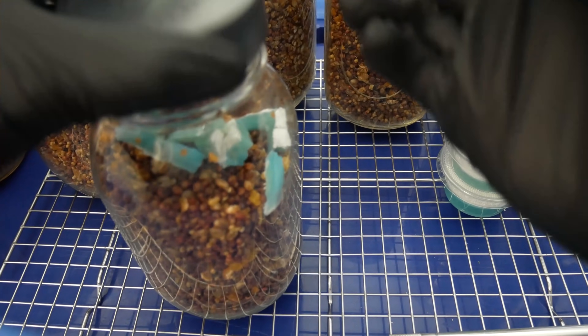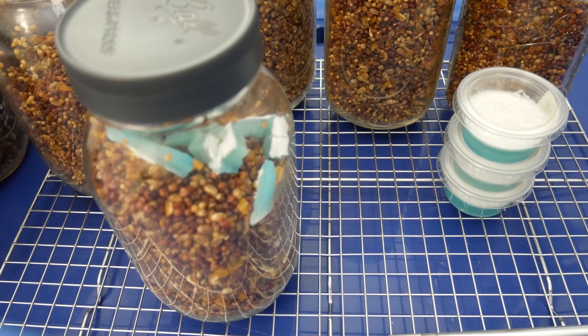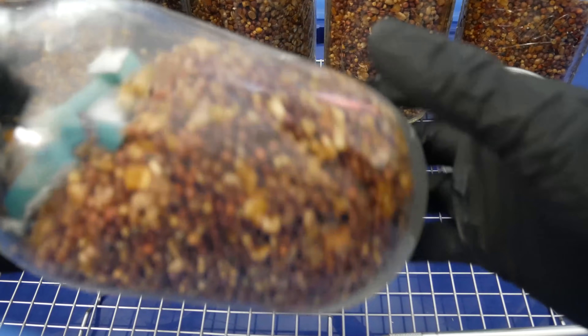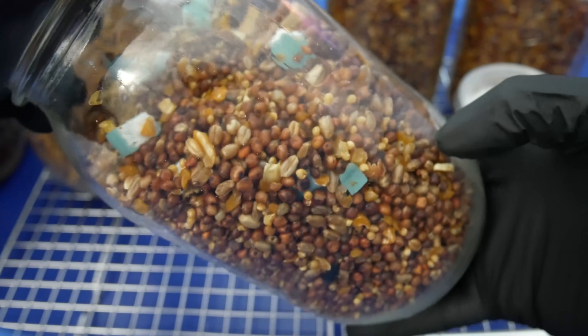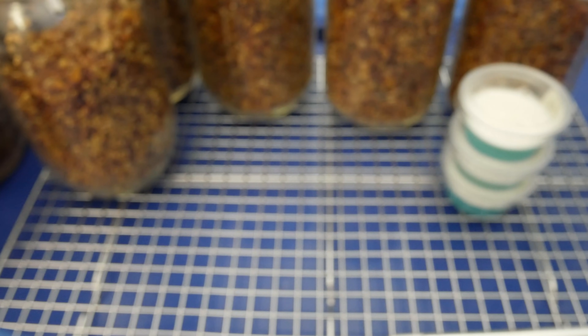Once you have your agar cut up, we'll open up the lid, drop our agar in there — the complete dish — and close up the lid. You can see I spent maybe one or two seconds with the lid open. The quicker you can do this, the less chance of any contamination getting inside the jar. Now with the agar in, I'll go ahead and shake this up and distribute the agar along with the grains, getting this thoroughly mixed up so that you get inoculation points everywhere inside the jar. You can see little bits of agar have been broken up, and the more inoculation points that are spread out, the quicker you can colonize your grain jars.